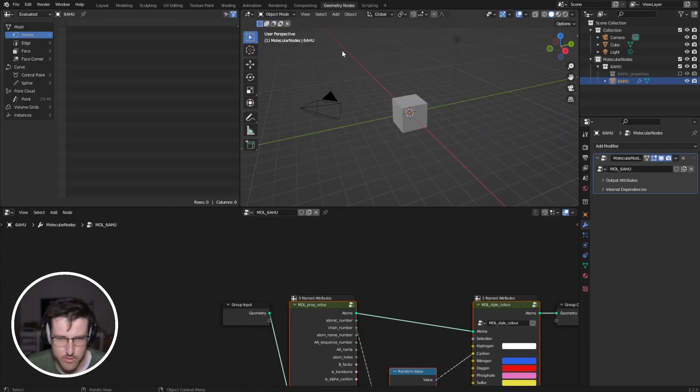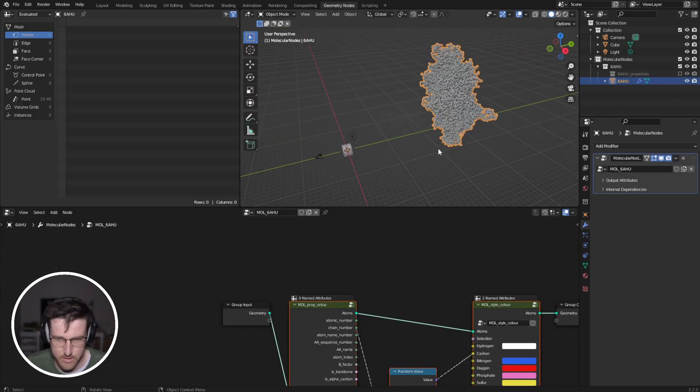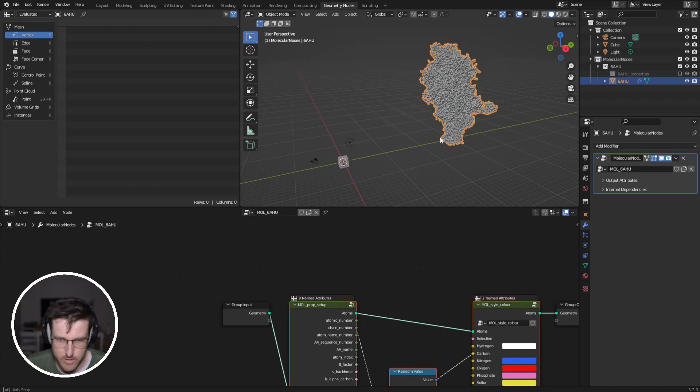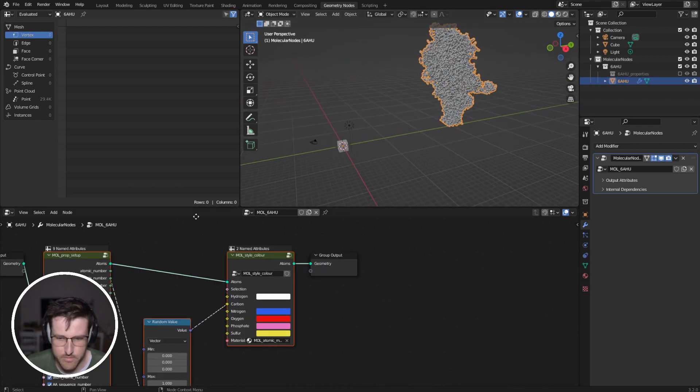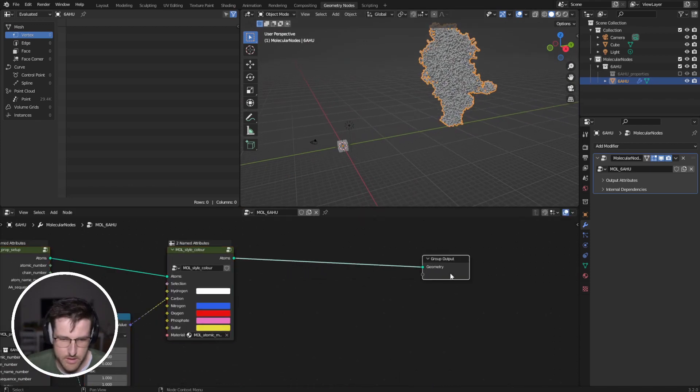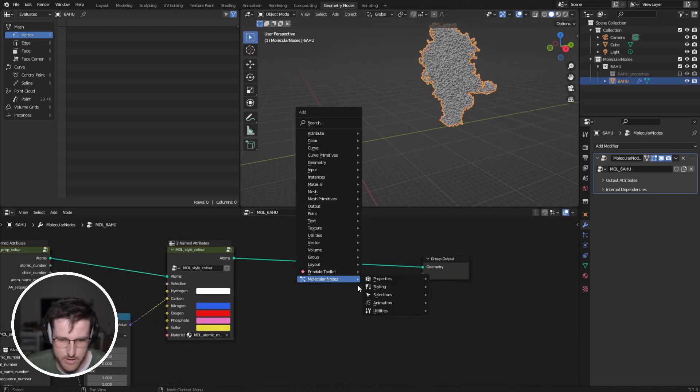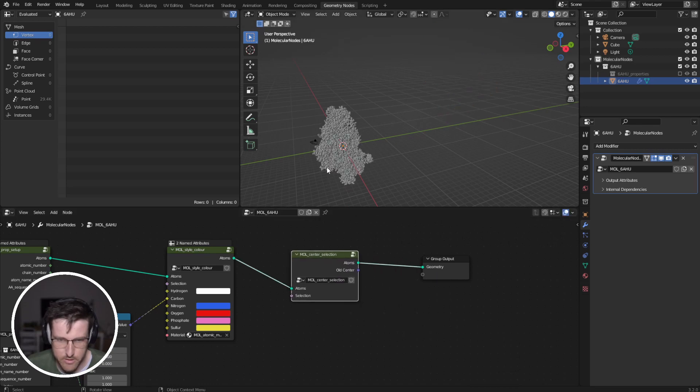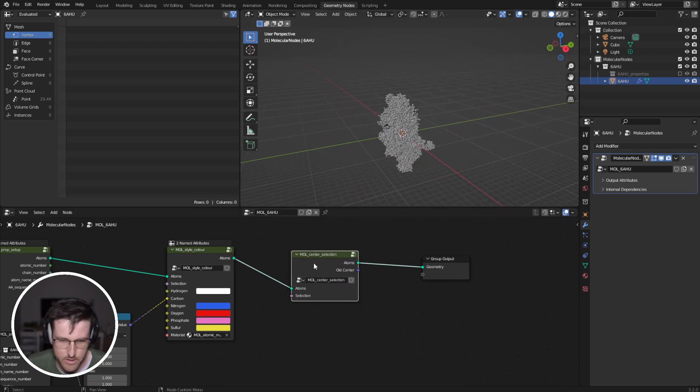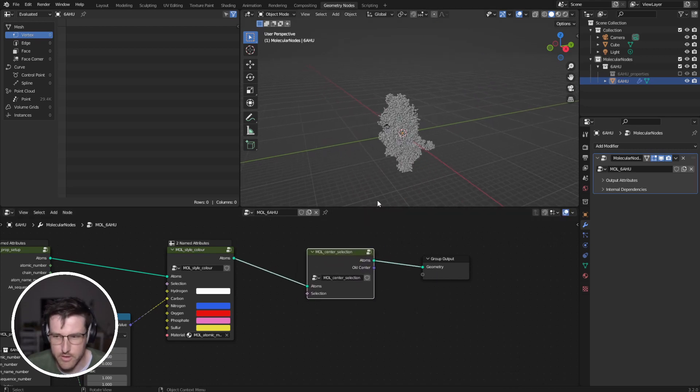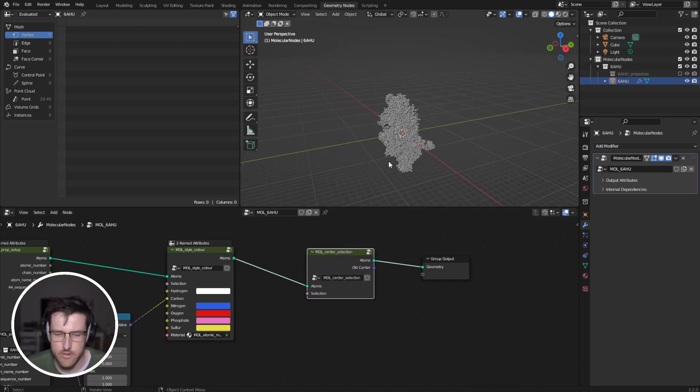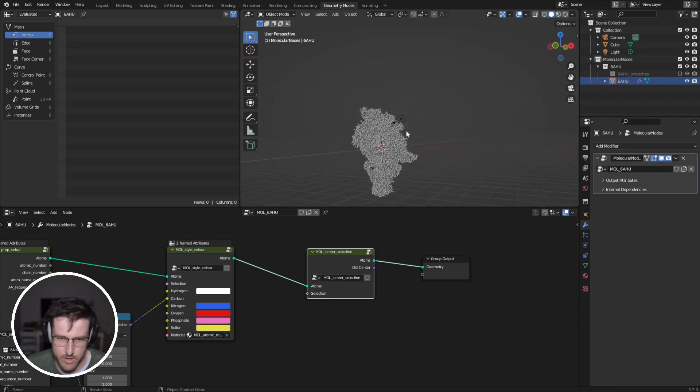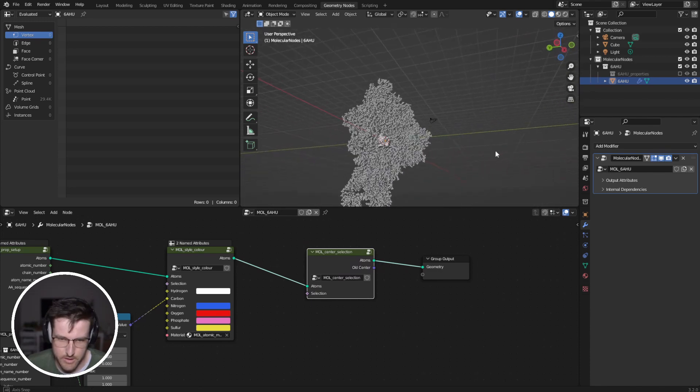So I'm going to go to our Geometry Nodes workspace, move up there, and to get it into the middle I'm going to use the Center Selection node, which if you give it a selection like I talked about in the last video, it will then put that in the center.